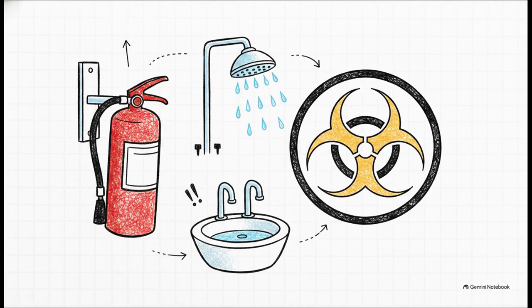But hey, biological aerosols aren't the only thing we have to worry about. Labs are packed to the brim with flammable chemicals, gases, and high-voltage equipment. Fire and general hazard awareness is absolutely critical. You literally must always know exactly where the fire extinguishers, emergency showers, eye wash stations, and spill kits are located. And of course, you must immediately recognize the universal biohazard symbol. Missing it or ignoring it can honestly be fatal.